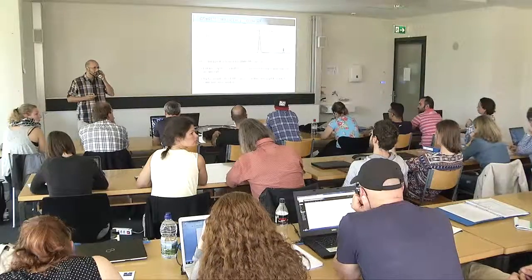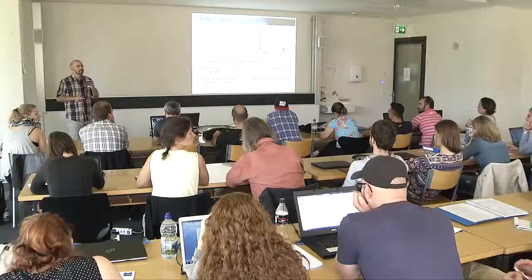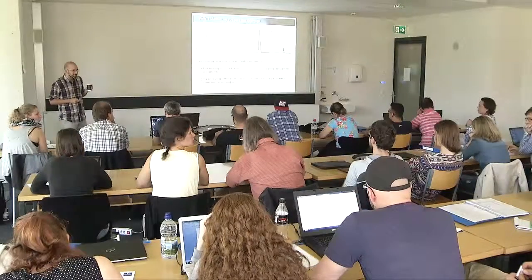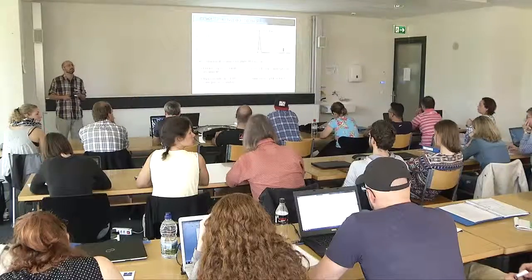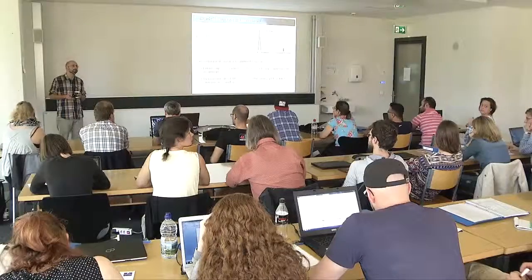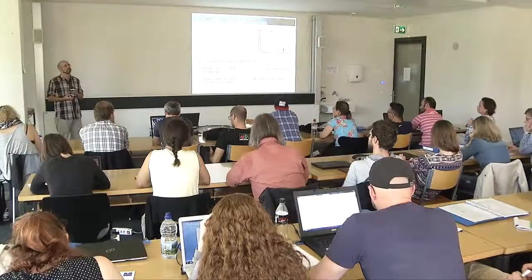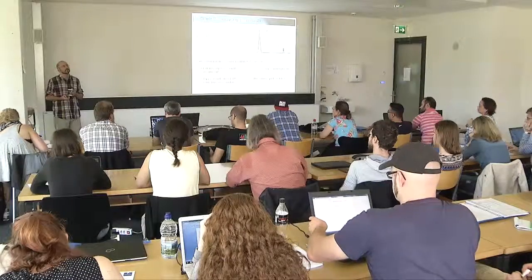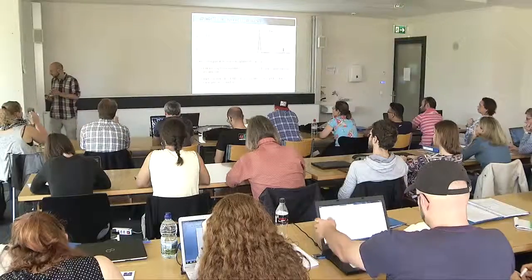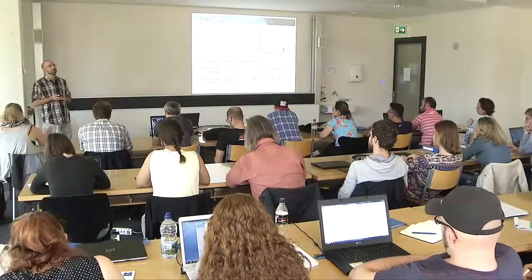Have a series of serine, or a mix of serine and threonine. Sorry. Do we have actually some software where we can design different combinations of a peptide we identified first? So you're asking about the case of multiple phosphorylations?